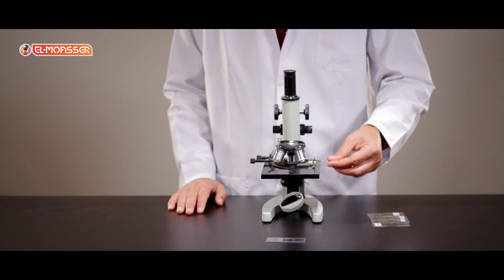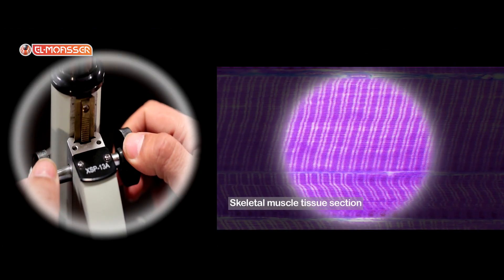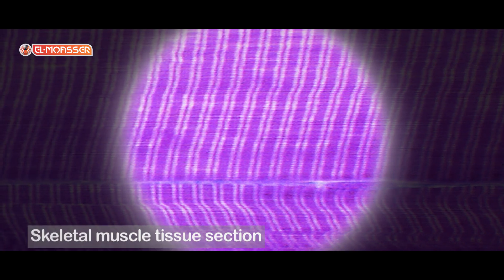Place the fifth slide on the stage. It represents the skeletal muscle tissue section. The skeletal muscle tissue consists of unbranched fibers with transverse lines.